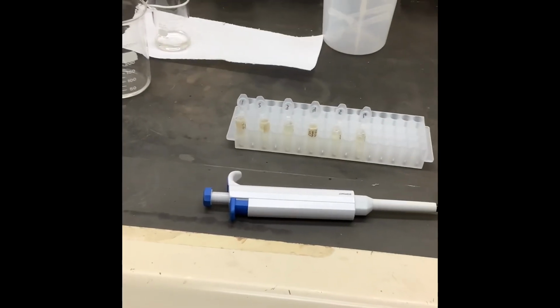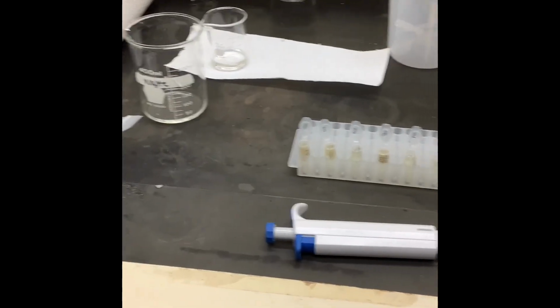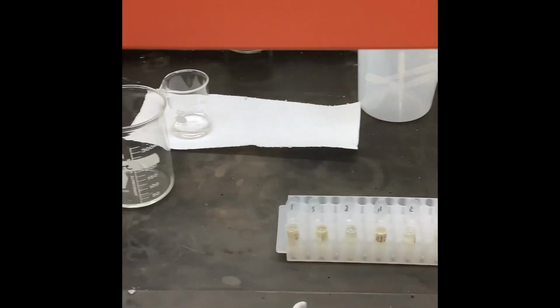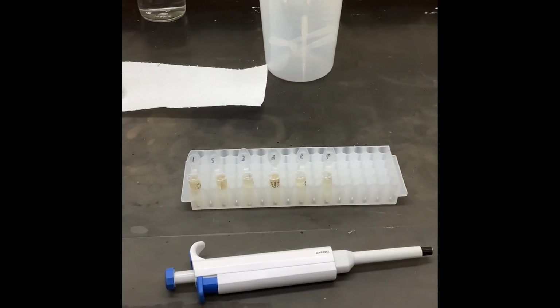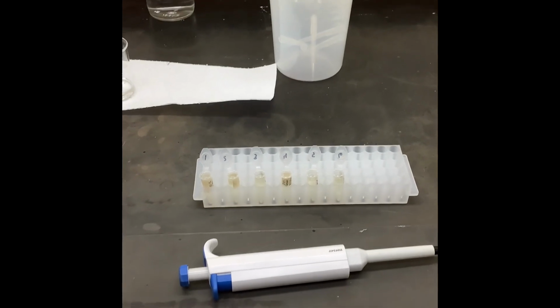Following the centrifuge step, you're going to decant all of the glacial acetic acid from all the samples into the waste beaker. Then you're going to add 900 microliters of the acetolysis mixture into each of the tubes.